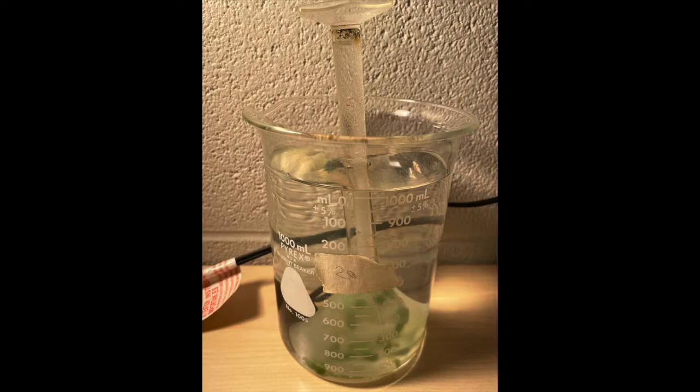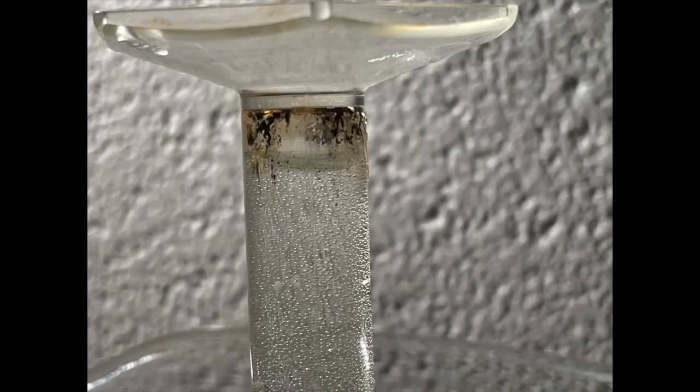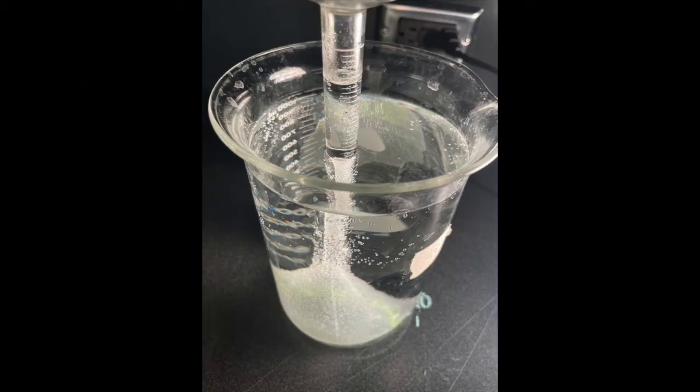After 3 hours were over, we observed that for the beaker that was 20 centimeters away from the light source, the temperature increased from 22 degrees Celsius to 30 degrees Celsius, making the beaker feel warm. There were more bubbles visible in the sample, and 3 milliliters of water had been displaced.